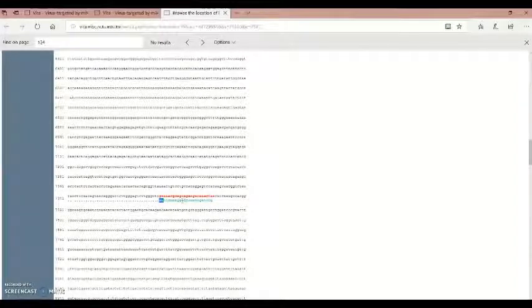Here we have no alignment, and here we have alignment again. So this might be the seeding region actually. It might form quite a good seeding region based on three nucleotides right there. Then we have no attachment, and that'll be it really.